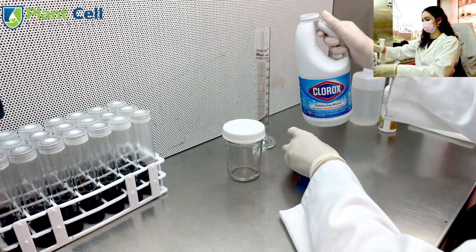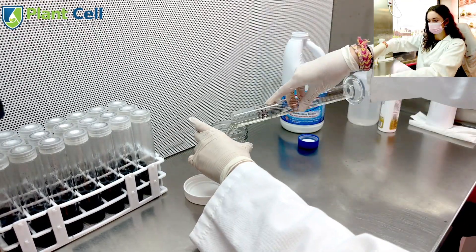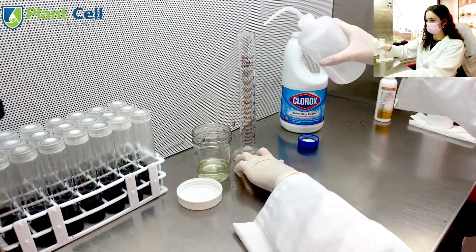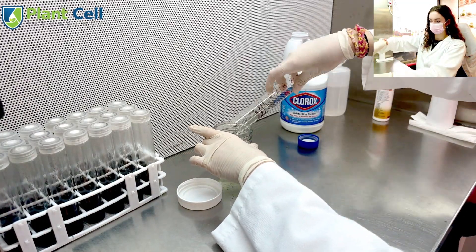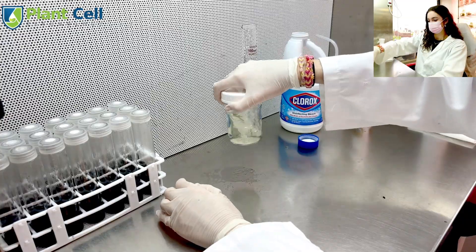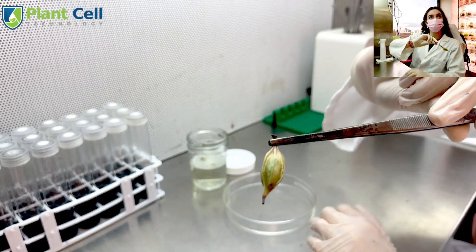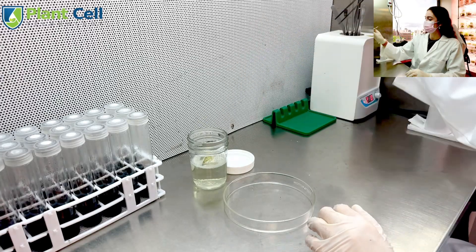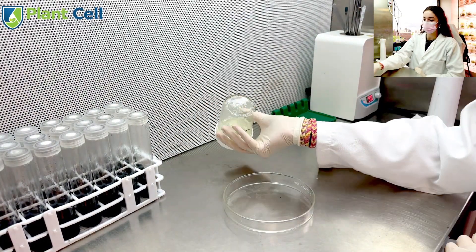I begin with pod sterilization, where I start off by using 70% alcohol to sterilize my workspace. I will then create a 50-50 mixture of both bleach and water that I will add to my jar. Next, I will add one drop of polysorbate 20 to act as a surfactant. This is the seed pod I will be using, which I will add to the bleach solution. Next, I will shake the jar and put it on our orbital shaker for 20 minutes.